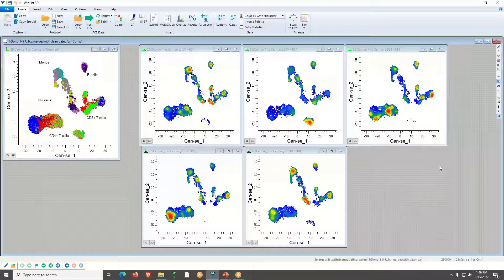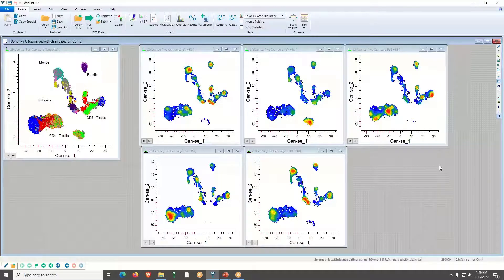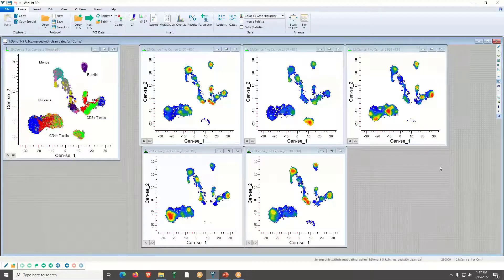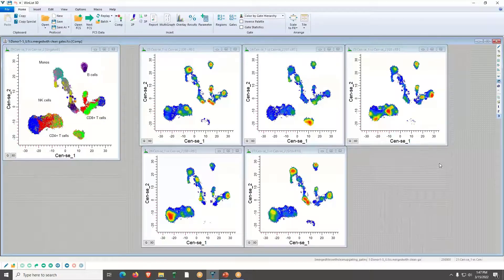Paul clarifies: 'So if I understand correctly, if I want CD4s to stay in the lower left and I'm creating a new dataset with the same gating hierarchy, it would at least recreate something around those orientations — is that right?' Ben confirms: 'Yes, that is correct.' Paul: 'Cool, nice job.' Ben: 'Thanks Paul.'